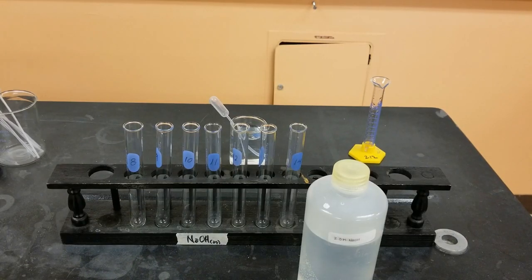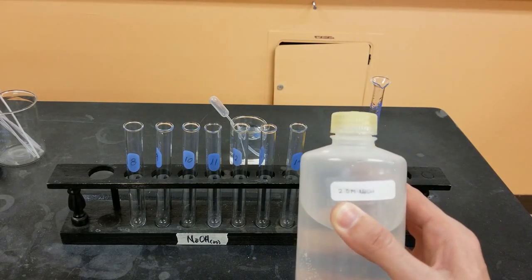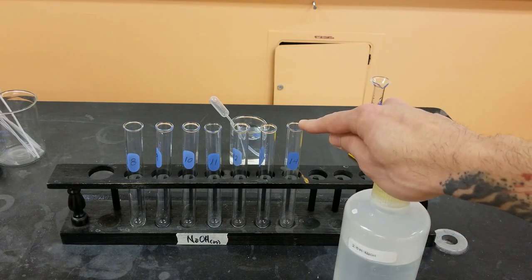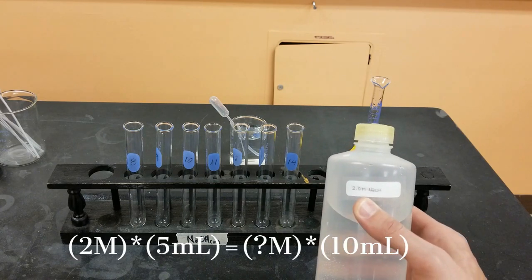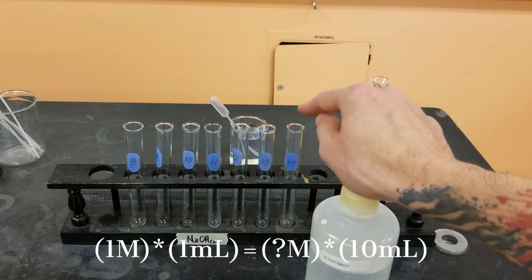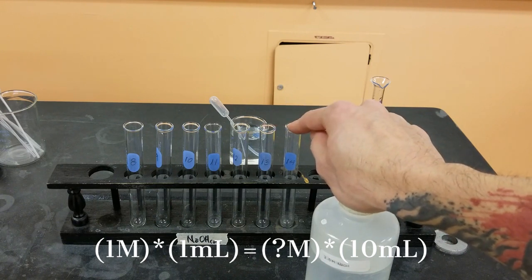In the next part of this, I'm going to be making various sodium hydroxide solutions. I'm going to be starting with a 2 molar stock solution of sodium hydroxide, and I'm going to be starting actually with test tube 14. In test tube 14 there will be 5 milliliters of this with 5 milliliters of water. I'm then going to create the solution for test tube 13, which will be 9 milliliters of water and 1 milliliter from test tube 14.